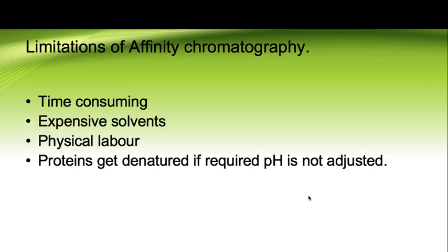Moving on to the last part, limitations of affinity chromatography. It is a time consuming process. It involves expensive solvents and it also requires physical labor, and the proteins usually get denatured if the pH is not adjusted properly.